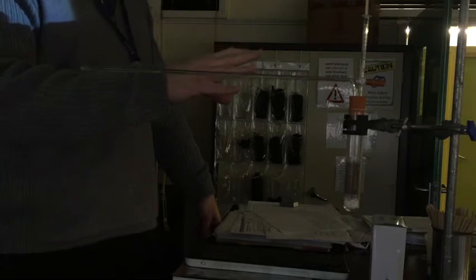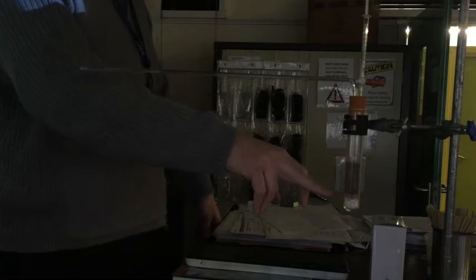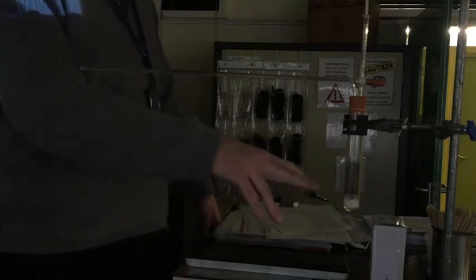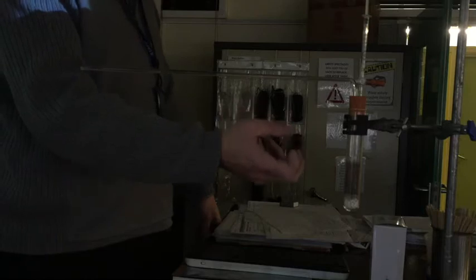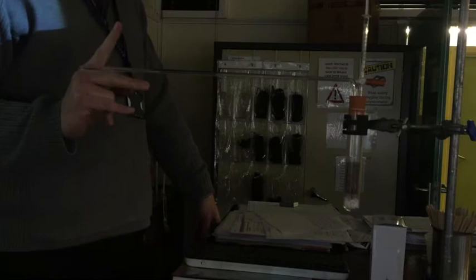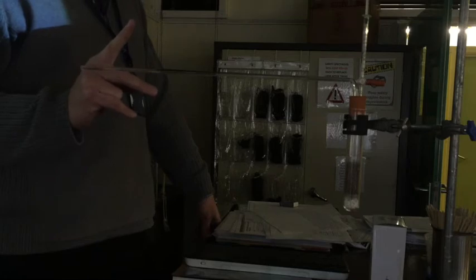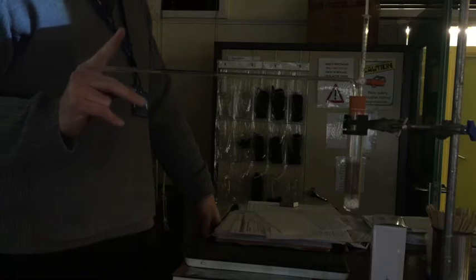So what we need to do is we need to actually chemically lock away the carbon dioxide. And so we add this special chemical. Now there are two chemicals you can use for this. This chemical here is called sodalime. The other chemical you can use is a liquid called potassium hydroxide. Both of which react with carbon dioxide and cause the carbon dioxide to be locked away. So now, instead of the carbon dioxide being produced, as soon as it's produced it's locked away, which means the total volume of gas is going to go down. So we can actually now directly measure the rate of the chemical reaction of glucose plus oxygen goes to carbon dioxide plus water, because we can measure the rate of use of oxygen.